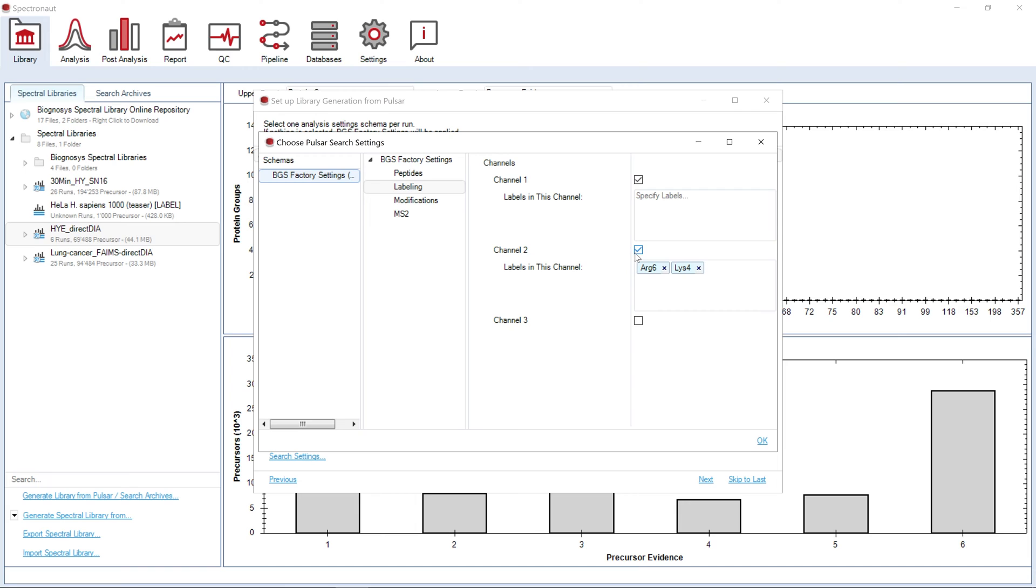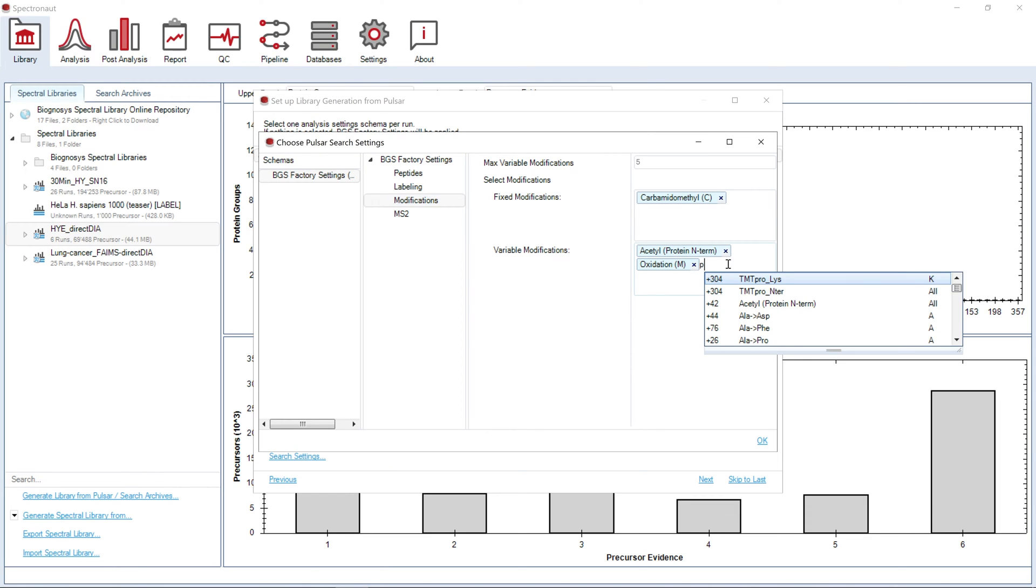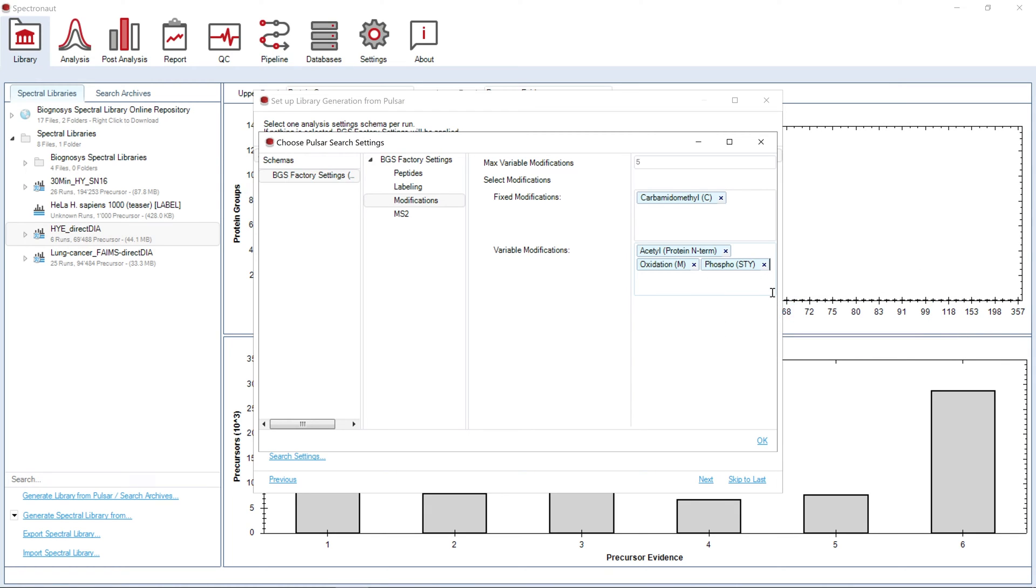The next node allows us to set up fixed and variable modifications that can be added to the search of your samples. Spectronaut will allow you to choose from a variety of modifications predefined in the database perspective, including user custom modifications.